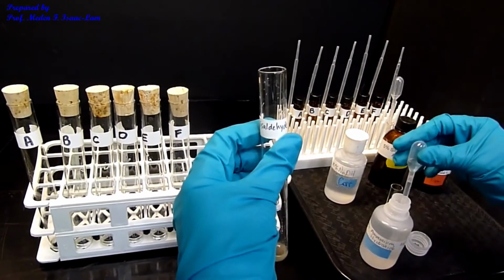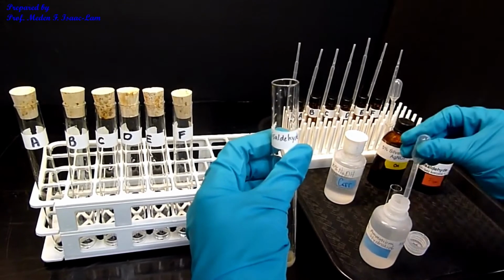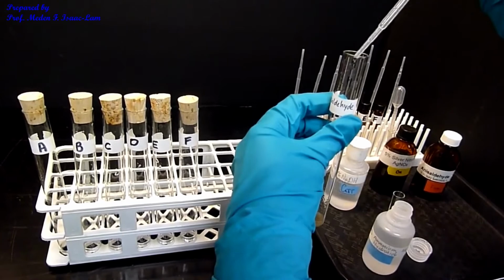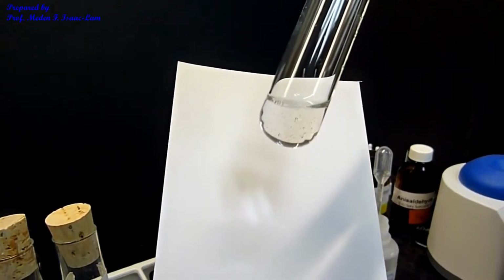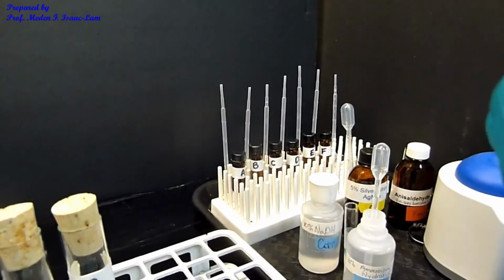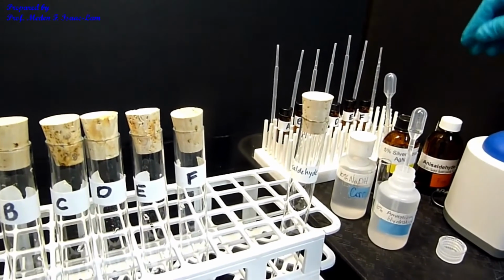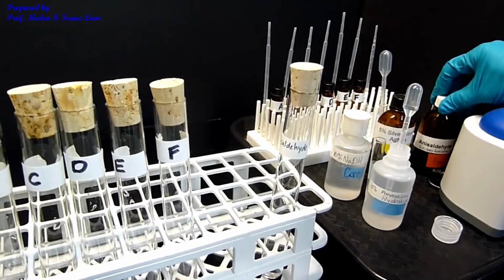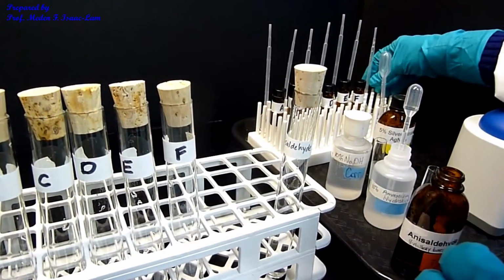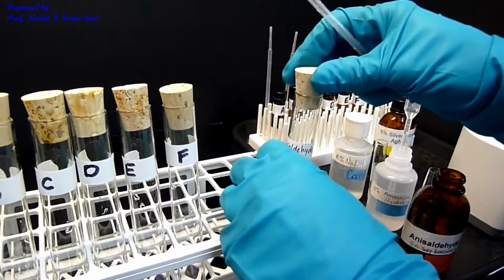So I'm going to count the number of drops. So after I added ammonium hydroxide, 20 drops, it dissolves. So now I'm going to add the standard anisaldehyde, 3 drops.